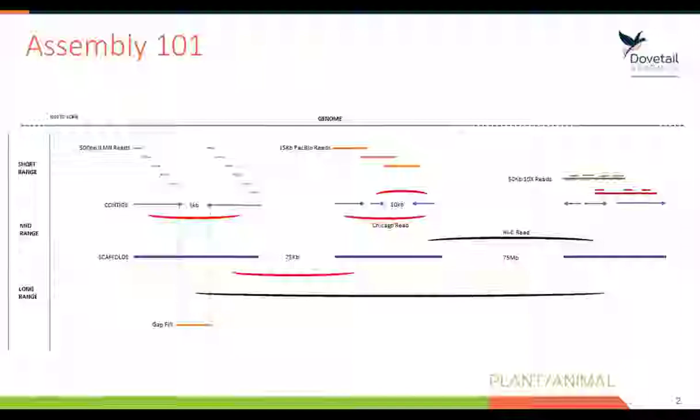PacBio long-range technology or long-read technology, shown in orange there. 10x Genomics is a newer technology that we're starting to use at Dovetail that is a synthetic long-read technology. And there's also Oxford Nanopore, which is a newer long-read technology as well. And we will choose the appropriate technology based on our knowledge of the organism that you're working with. So, but it's really about selecting the right tool for the job.